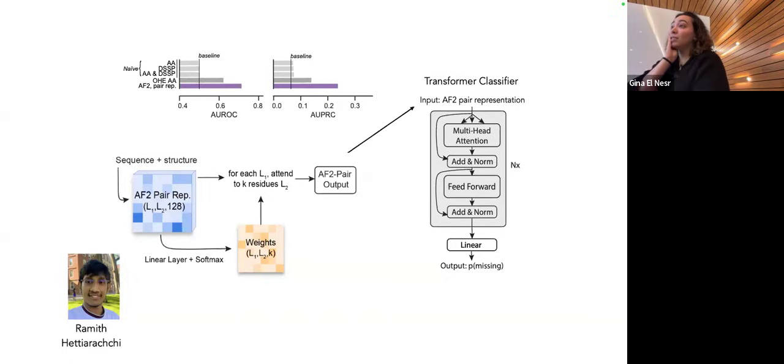Yeah. Talk a little bit about the size of the data sets. From sequence or from structure or from NMR? Oh, okay. So we had 10,000, and then we filtered that down and ended up with 2,713 points, right? Yeah.